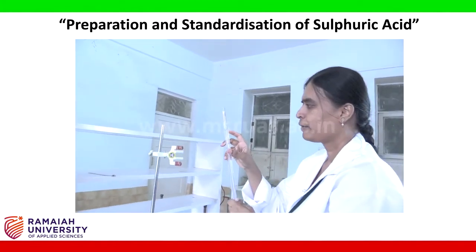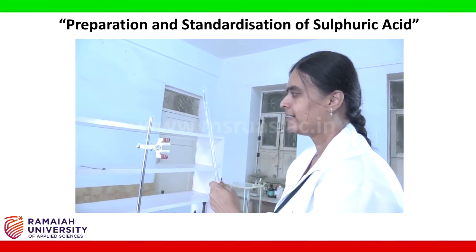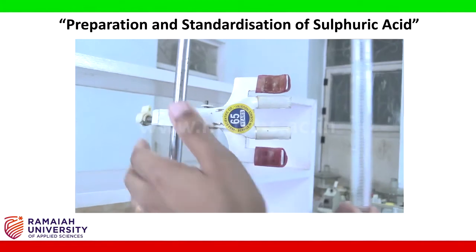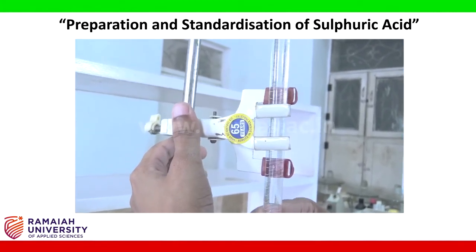Fill up to the 0 mark and check the lower meniscus as it is a colorless solution. Clamp vertically in the burette stand.